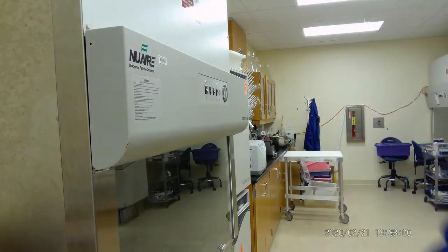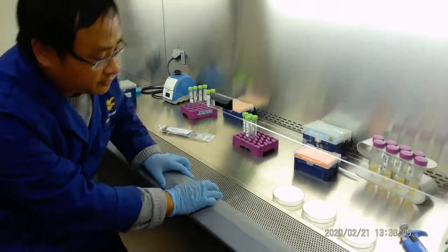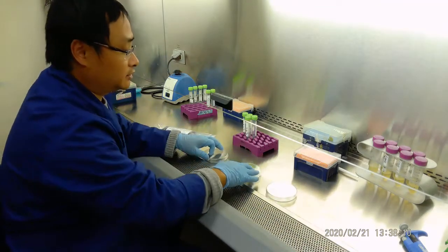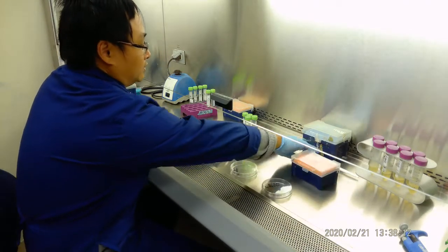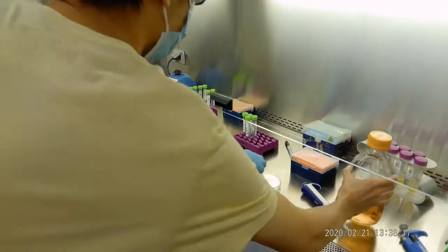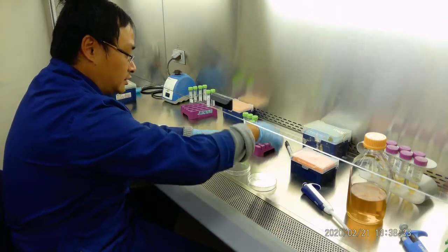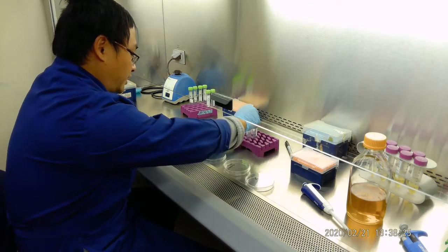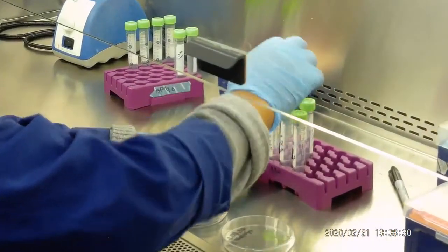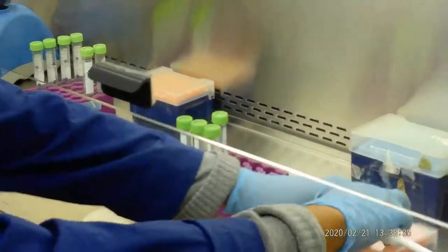Okay, now we're going to do a pour plating. We already finished the dilution. So what we're going to do? Lee will have melted agar ready. For the pour plating, because mild heat will kill bacteria, we're going to use a little bit lower dilutions. So what we're going to use here is 10 to the 5, 10 to the 4, and 10 to the 6. Oh, sorry, 10 to the 2. Okay, so we're going to use those three.